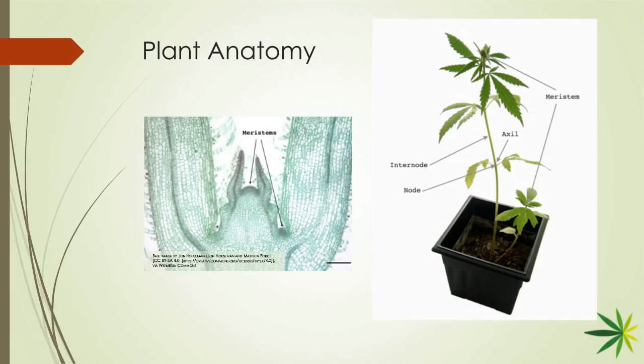Those are the growing tip, and that little tip will eventually elongate, and the leaves that spin off from the side will eventually grow into full leaves. If there's a meristem off to the side, like the one on the right, that may become a branch. Those are the parts we're interested in because they're cells that know they need to be growing. That's their mission, and that's what they're set up to do. They're the ones that make new cells. The other cells have their mission and their fate in life is set, and they can expand, but they can't really divide a whole lot.